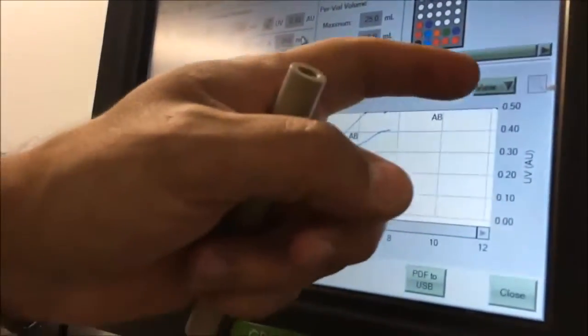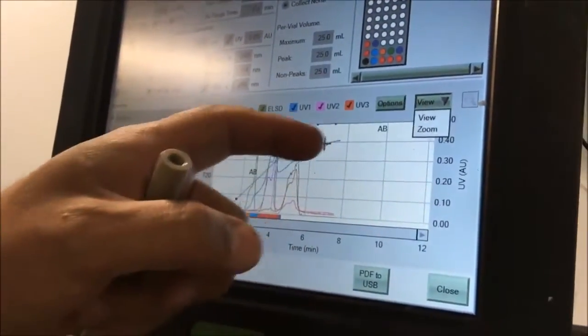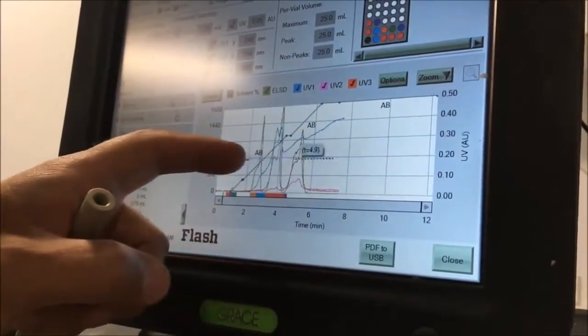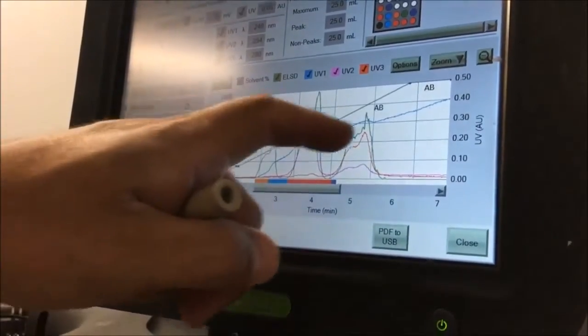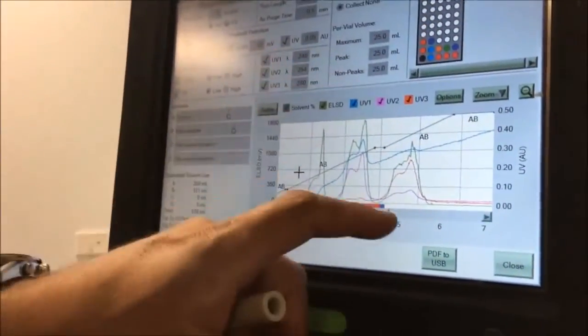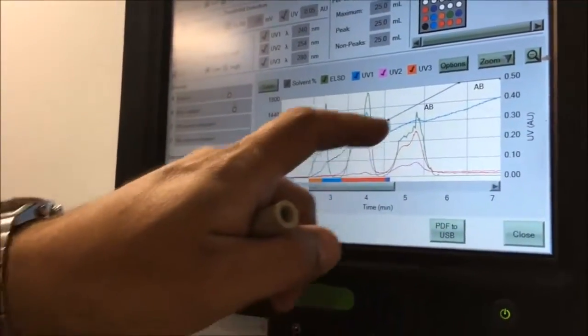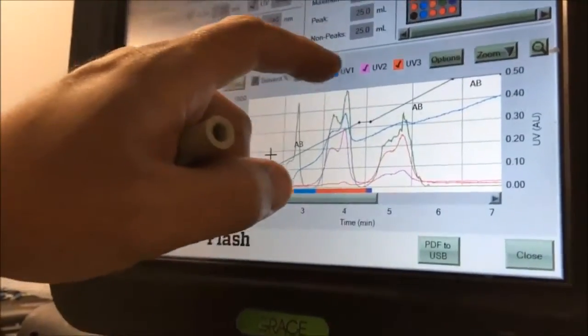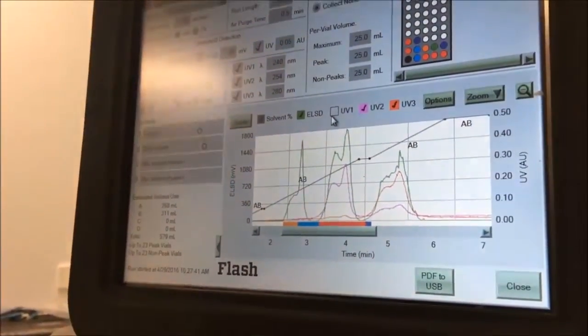So from here you can actually zoom across, as long as I can select it, zoom across there. Now that blue line is absorbance of ethyl acetate. That's why the instrument continued the 5-minute run. It's calling it a signal, but it's not a real signal, it's the solvent. So we should have selected a higher wavelength.